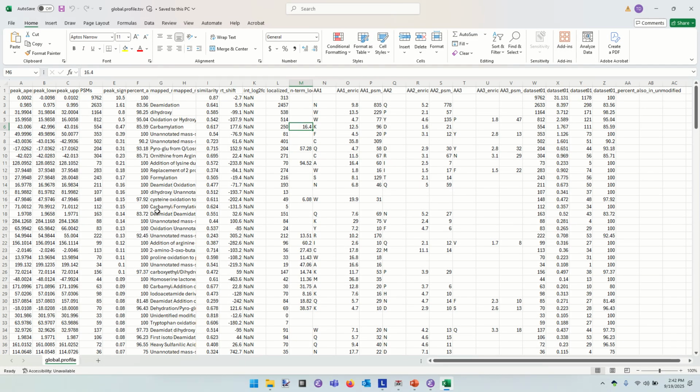When we look at the D here, do we think that this aspartic acid is a strong signal or not? And here I would point to the amino acid 2 enrichment score. Here it's only a 1.6. If that number is above 1, well, it happened more than you'd expect by random chance. But 1.6 is not a lot more.